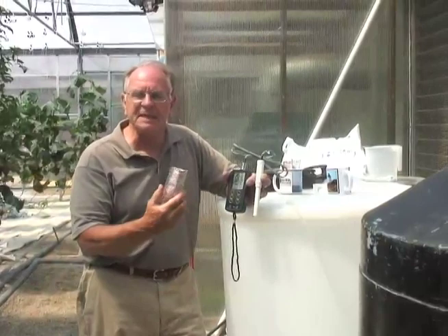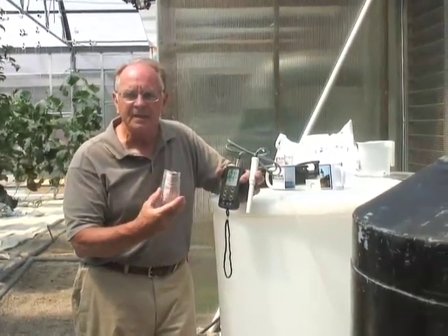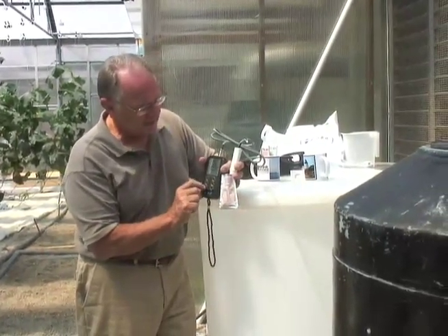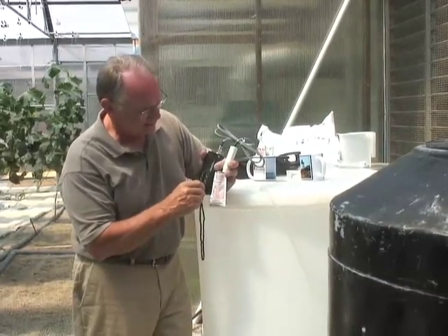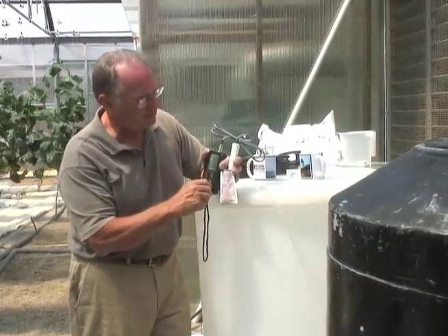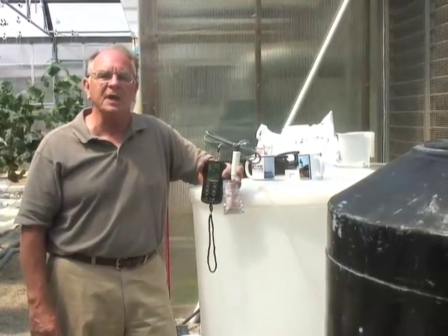To calibrate the EC, we use a known calibration solution — this is 1413 microsiemens, which is 1.4 millisiemens. You put it on the millisiemens mode, put the probe in the solution, and dial in 1.4, and you're done. Now we're calibrated for both pH and EC.